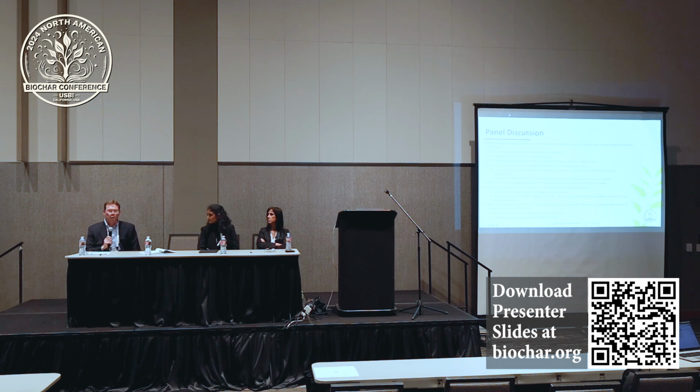In order for this industry to really flourish, it needs to have that alignment of all the different methods. And I'll offer that it already exists, at least for the most part, through ISO TC 238. The almost 50 methods that we've already created were designed for solid biofuels. The precursor materials that are already used mostly, except for manures. I don't think we have sludges and manures and biosolids included. But for the larger share of the type of products that are produced, these methods are already largely aligned. They need some subtle tweaking, but we already have a sense of what that is. And we already have a process started to develop them into biochar methods.